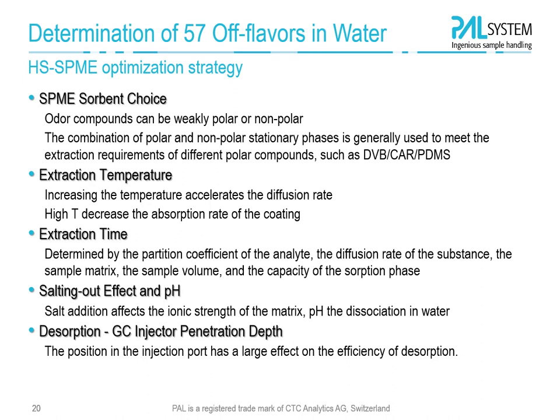We then see the effect of the extraction temperature and choose the most appropriate extraction time. A salt addition is important here, and also the consideration of a suitable pH for the sample. Last but not least, independent from the sampling processes, the correct desorption in the GC injector is responsible then for the nice chromatograms we get.